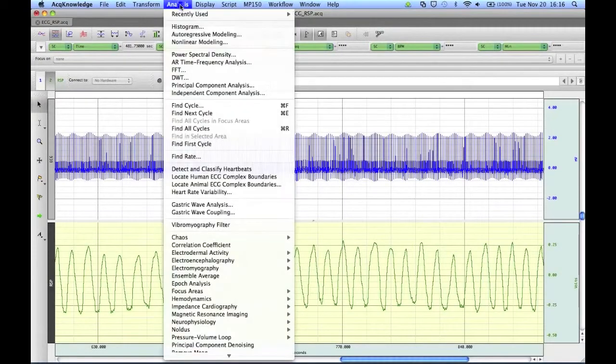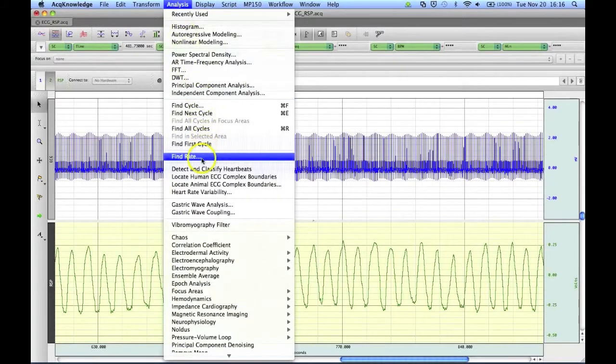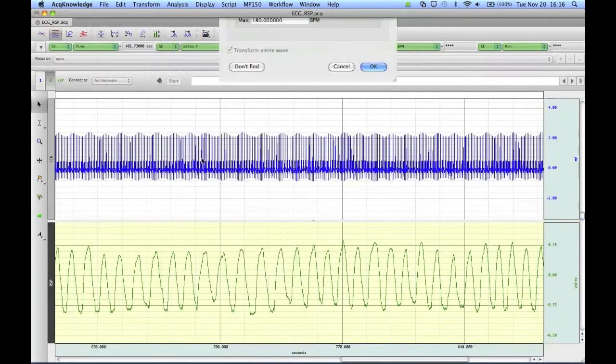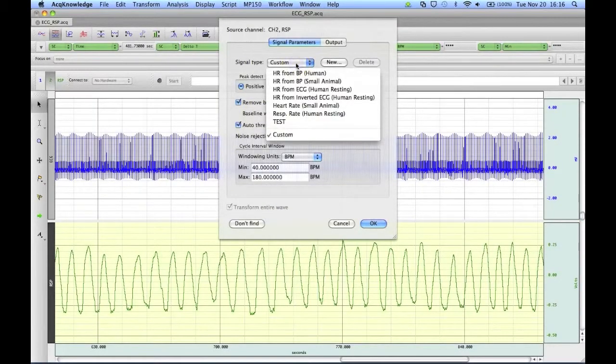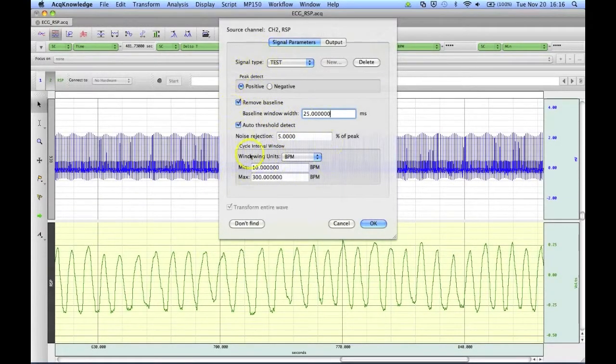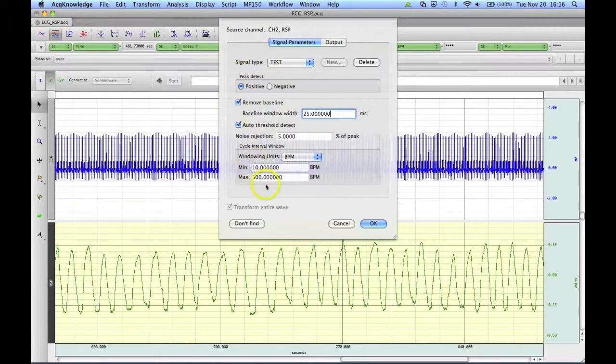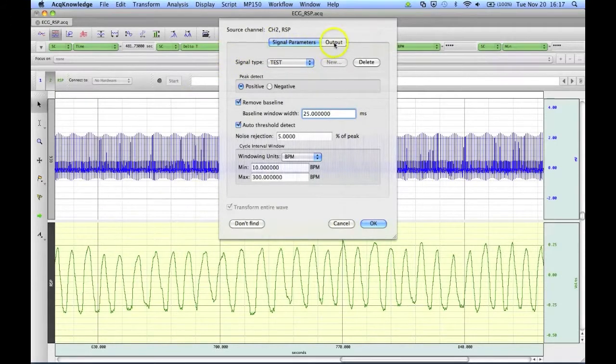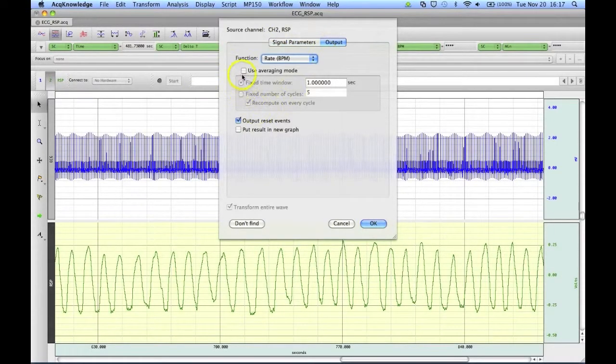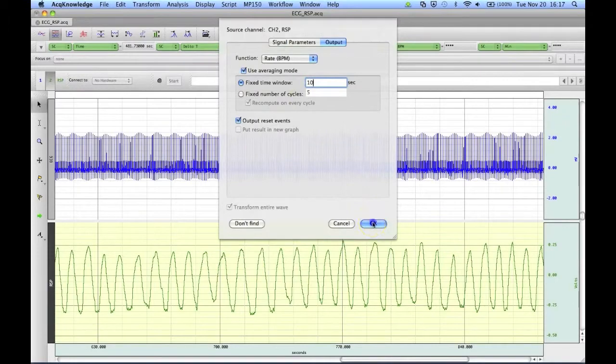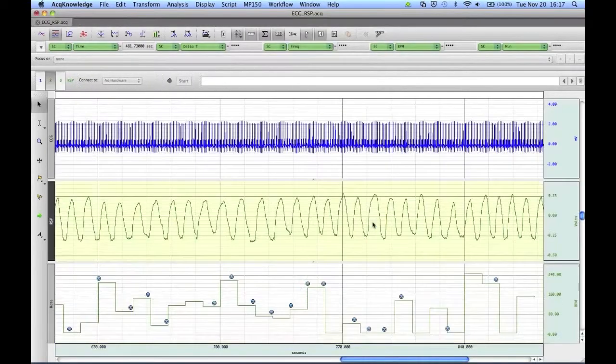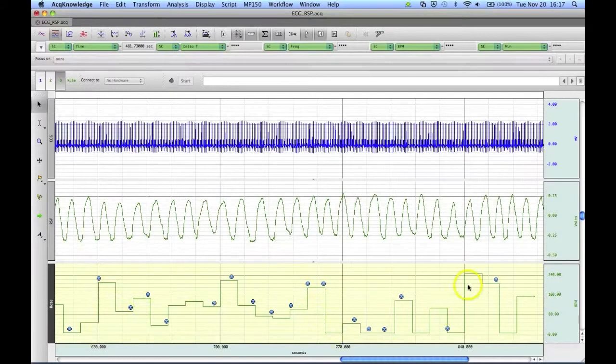We can see our rate preset under the Find Rate option. We can click the drop-down menu, select Test, and we'll see the custom information we had just put in, the between 10 and 300. However, on the Find Rate section, it does not hold the output settings. So if we wanted to use the averaging mode again, we'd have to reset that here, enter in the 10, and then we can click on OK. Now you'll see our rate here, with the custom settings, has been put in as a new channel.